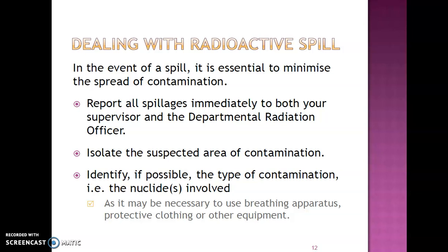Dealing with radioactive spill. In the event of a spill, it is essential to minimize the spread of contamination. Report all spillage immediately to both your supervisor and department radiation officer. Isolate the suspected area of contamination.